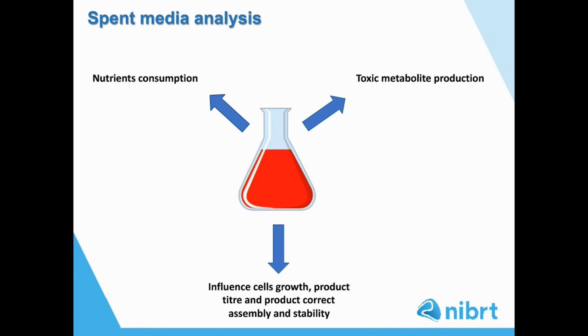For this reason, it is important to continuously monitor amino acid concentration, possibly with an on-line, an at-line, or an in-line measurement. Usually, spent media analysis is not straightforward, and this is due to the complexity of the sample matrix, and this can require lengthy sample preparation and lengthy analytical methods.